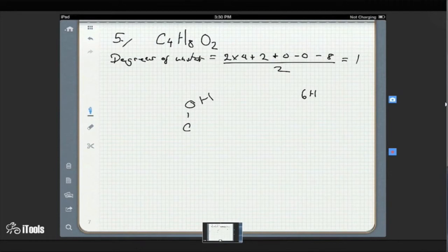I think there's still something you guys aren't noticing that's very important in the proton NMR spectrum. There's a lot of splitting. It's broad. Yeah, it's broad and it's split. But take a look at what they tell you right in front of the proton NMR spectrum. In front of the box. Oh, additional proton at 12 ppm. Oh, really? Thanks, guys.